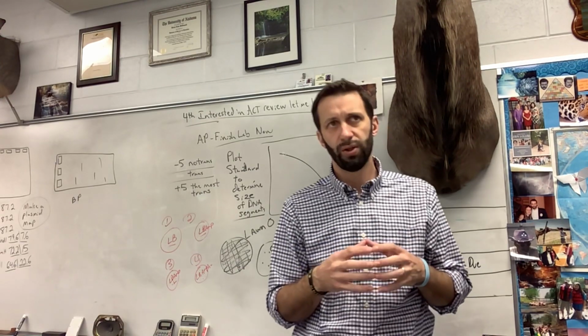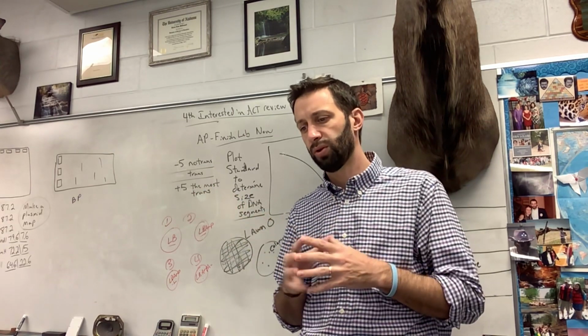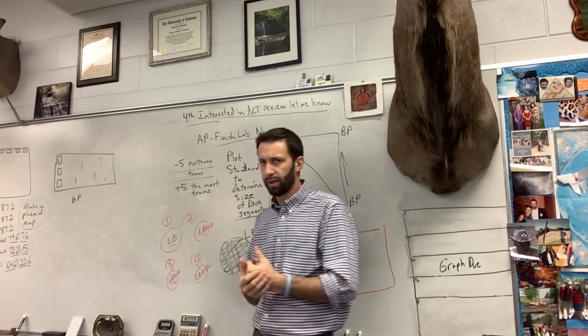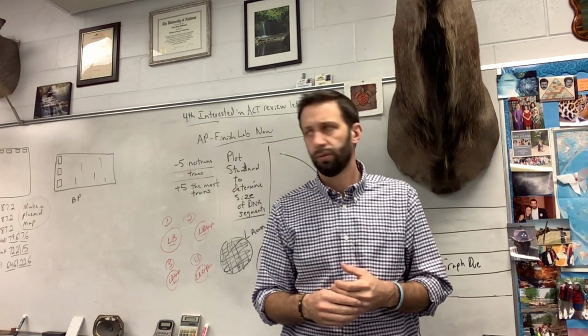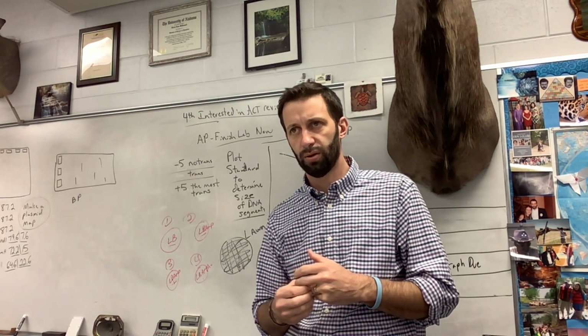So these questions have come up before on the AP exam, and if it comes up again, I want to make sure you know what's happening. So, what should have happened in that LB negative? Will there be bacteria or not? There will be bacteria. Okay, there should be bacteria.